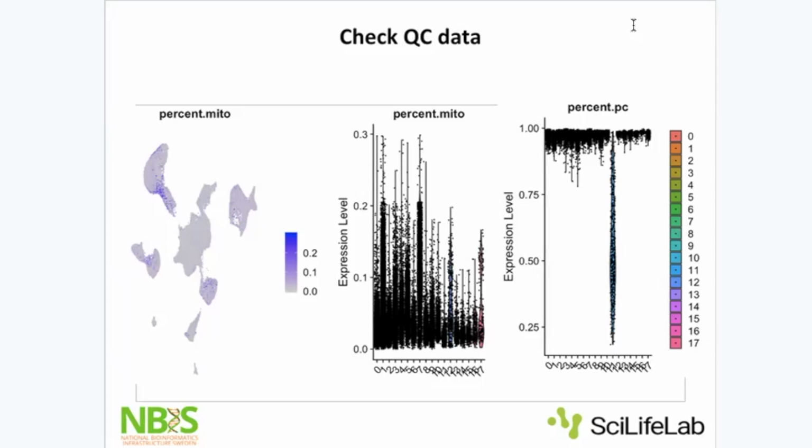So how do we decide whether one is better? Yeah, unfortunately, this is something that hasn't been super much evaluated. There were some papers showing that Leiden was better, but not really that thoroughly compared, I would say. It's also, I think, a trade-off of computational cost, as it is faster.